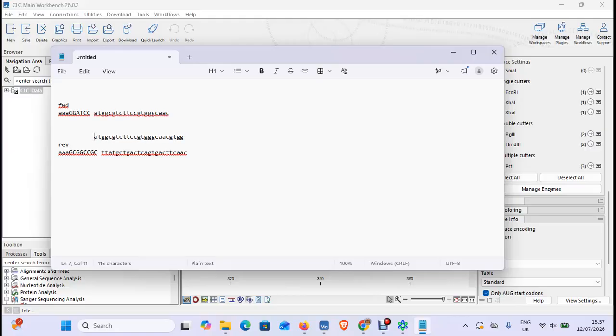Yeah, a simple 4 bases, but that increase in melting temperature means that primer will tolerate, well, first, it'll be more likely to stick to the desired location, but if things go sideways and you have undesirable, uninvited PCR products, you can actually crank the annealing temperature up, which is something I rarely resort to doing, but that will clear up your problem, potentially. Or at least it gives you a fighting chance. If you didn't add this extra, you cannot have that option.